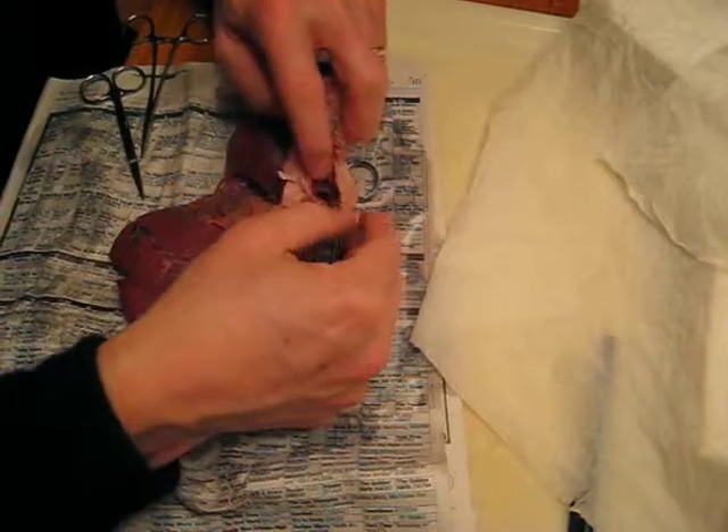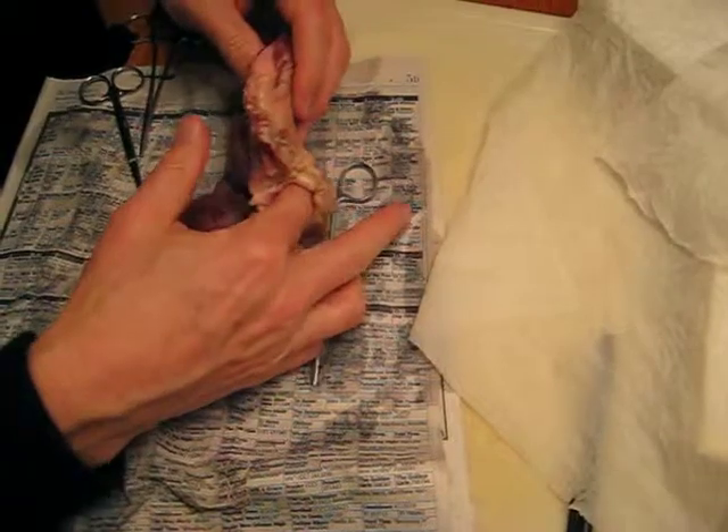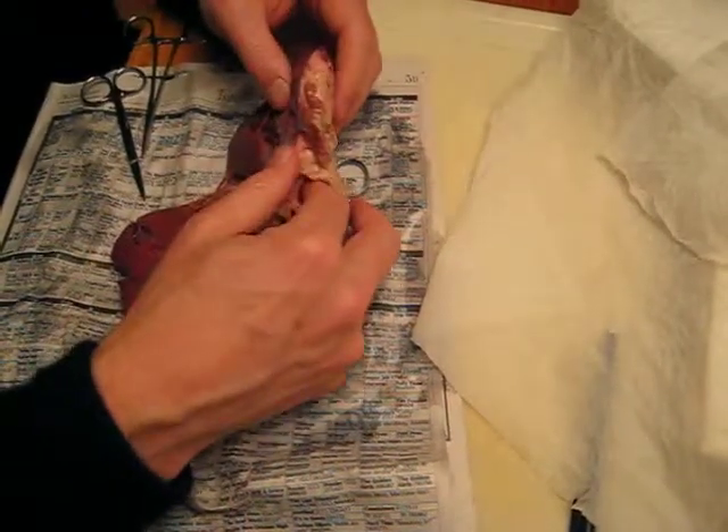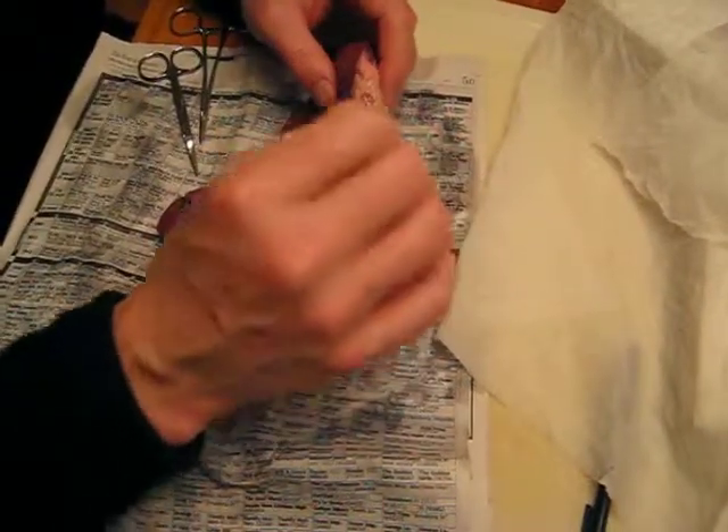It does a little bit, but remember that it doesn't have to be smaller. It can be bigger than the aorta. The aorta is a tough little tube.